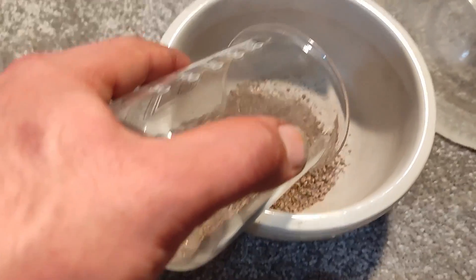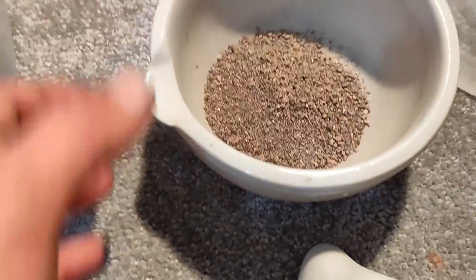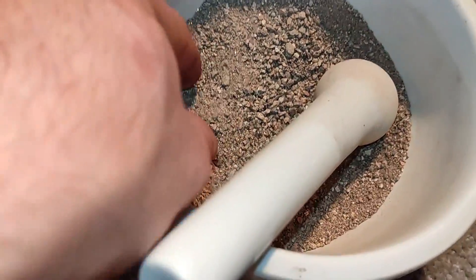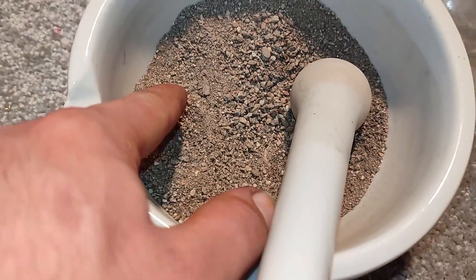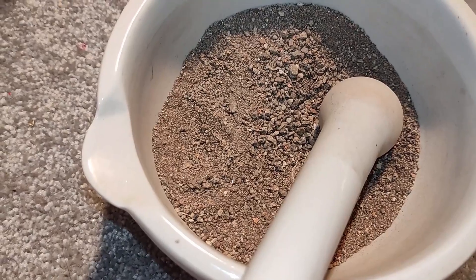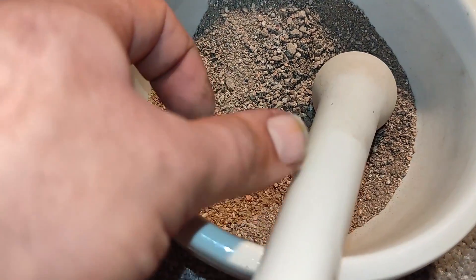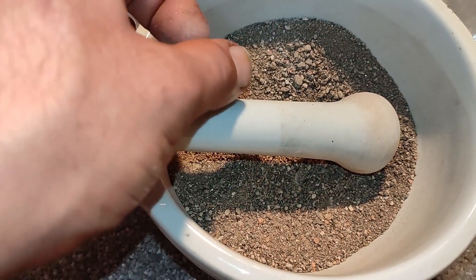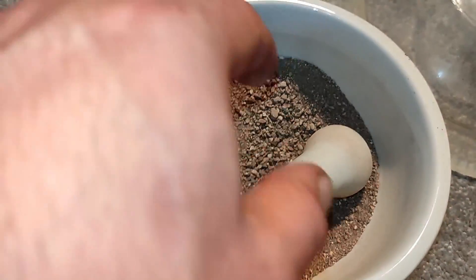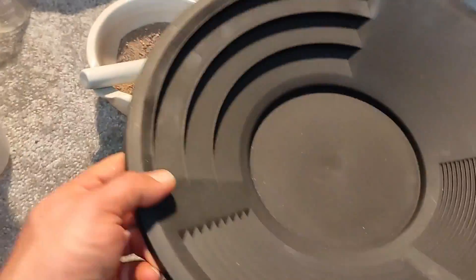I'm grinding using a mortar and pestle. I also need to mention that these shiny particles, which is iron sulfide or pyrite, have a density of about 5 grams per cubic centimeter, while gold density is around 18 to 19 grams per cubic centimeter.